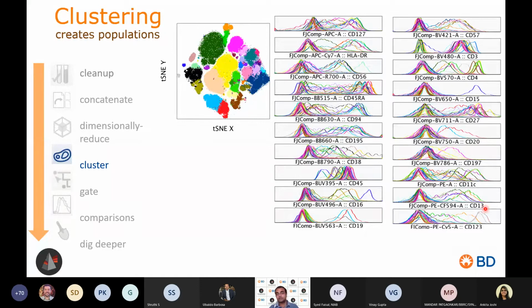And for example, CD123, the different clusters are color coded differently. So you can identify from the colors which markers are getting expressed, elevated or depleted in all of these clusters, and there's relative expression of all these. So this is really interactive. When you have a clustering algorithm already performed on your data, it sometimes makes sense to have an overall idea of where is my CD15, where are my granulocytes located, just to identify in a quick manner.